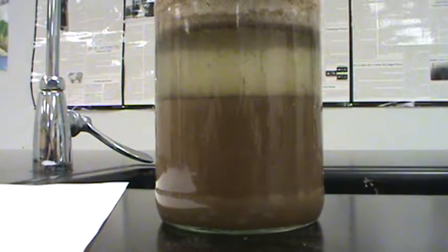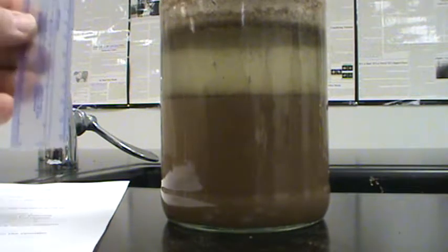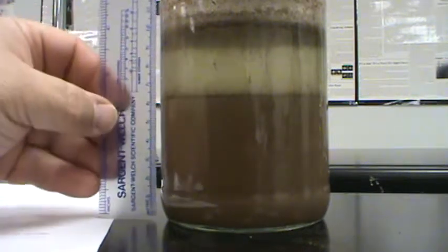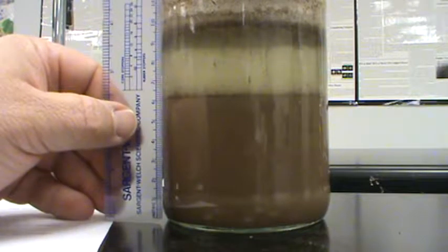Now, in order to do this, we come back to our chart, which, whoops, I don't think you can see that, right here behind us. After 24 hours, it's supposed to be, because we're supposed to do this during class, it asks, measure the sample after 24 hours. Well, yesterday we measured this at 6 centimeters. So we're going to set this down, and our sample is right back to 6 centimeters.